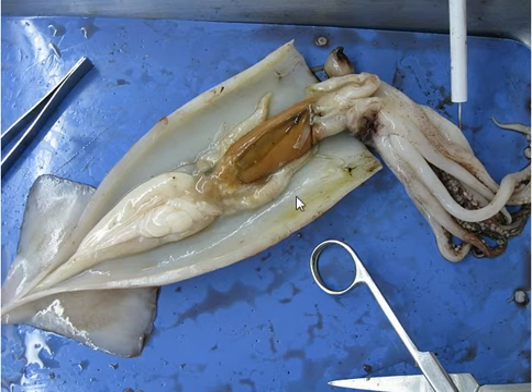It's already dissected, so this is the internal anatomy. This white part is the gonad, and these two things on each side of the liver are the gills. On top of that, this circular thing is the gill heart, and this is the liver.